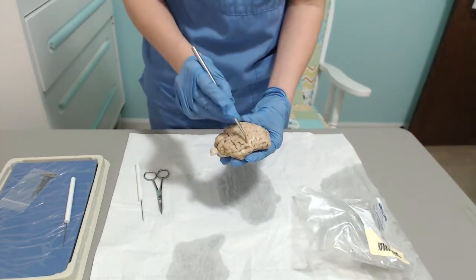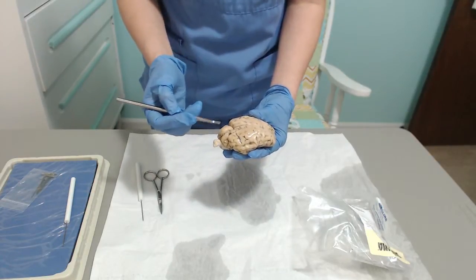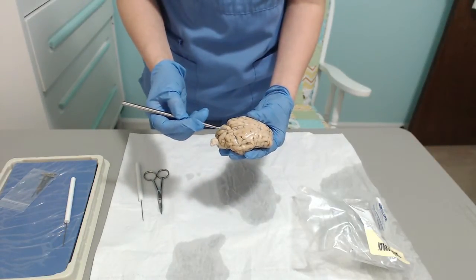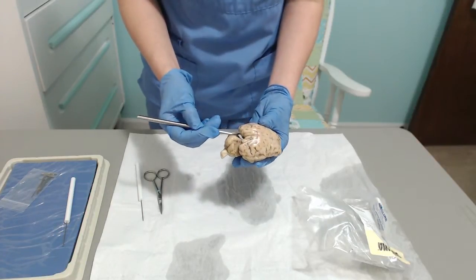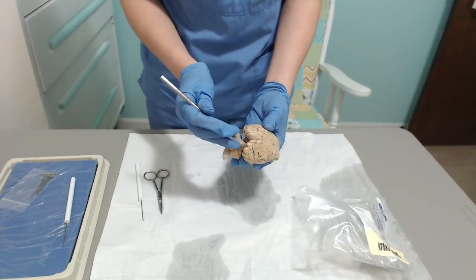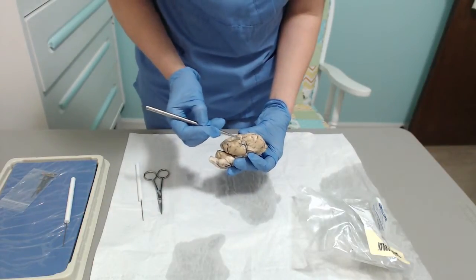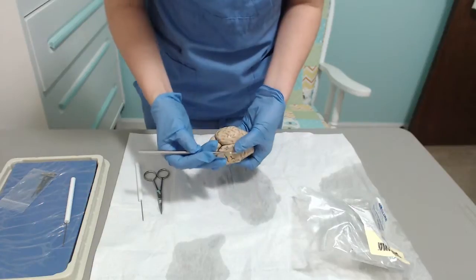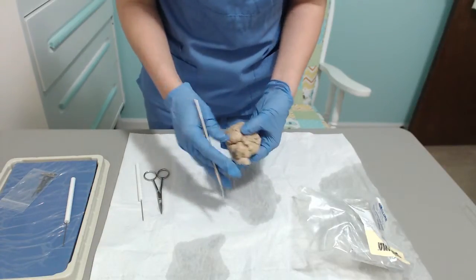The parietal lobes on each side. The occipital lobe is back here. You can see that. And the temporal lobes. So temporal lobes are right here. A little different placement, further back than on a human would be.